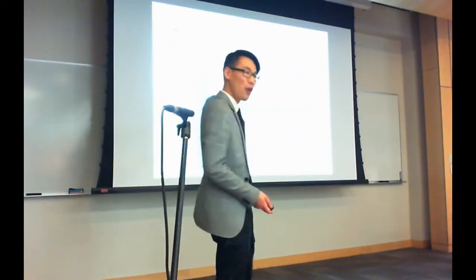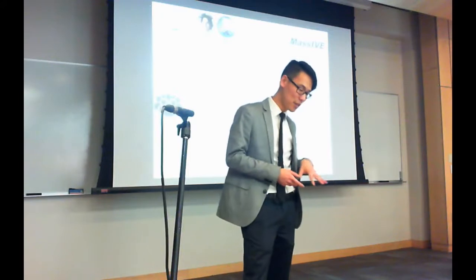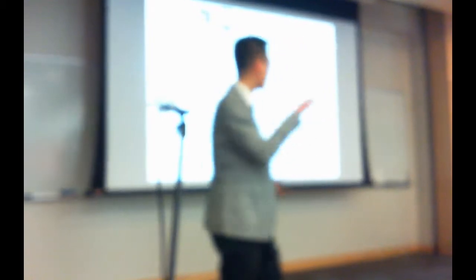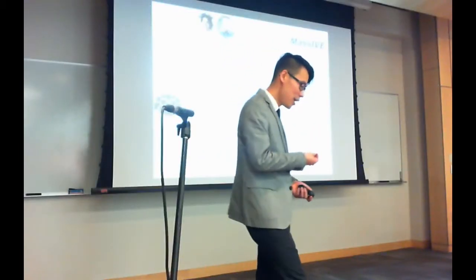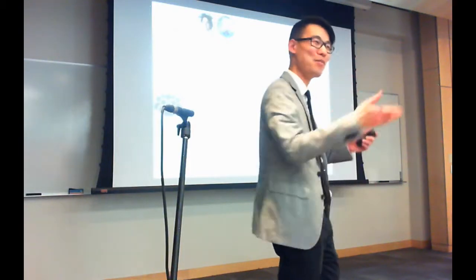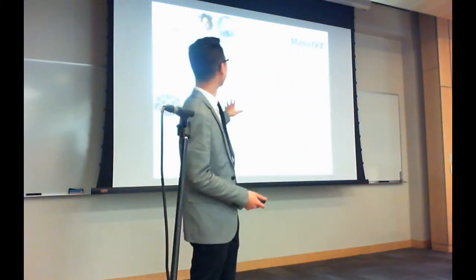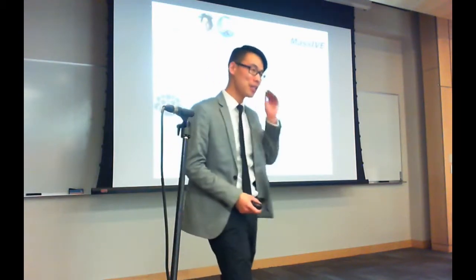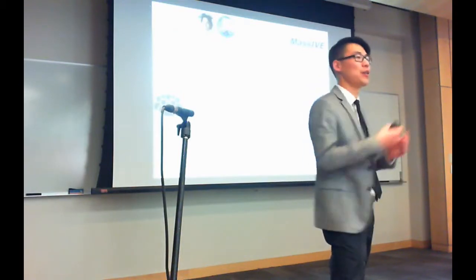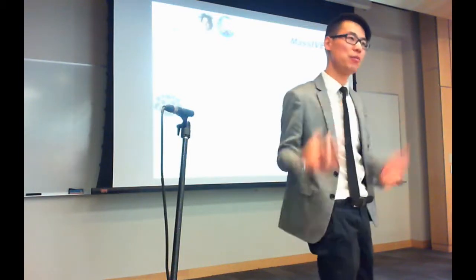We want to use all of it, or as much as possible. And so we ventured, so actually, one of the things we have here at UCSD that's run by Nuno, Pavel, and Vineet is the Center for Computational Mass Spectrometry. And we have started what we call the mass spec interactive virtual environment, a mass spectrometry data repository that specializes in reanalysis. There's so much data out there with no identifications. It's not really reusable for the community, and we want to fix that.